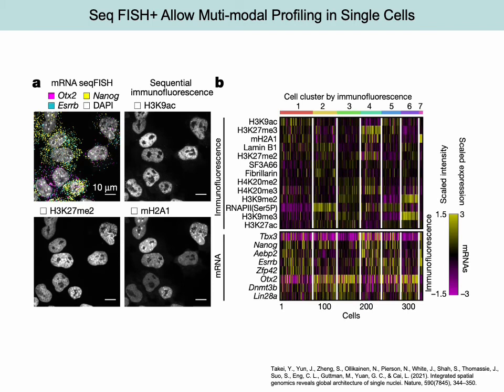And here is the one point I want to touch on before the end of time. If you look at just the global level of those epigenetic marks, the global level is really different in individual cells. You can see that for the H3K acetylation, the cell on the right has really different global staining versus the other cells, and for different marks, it's also different. And this is definitely not a staining artifact. This is very reproducible.